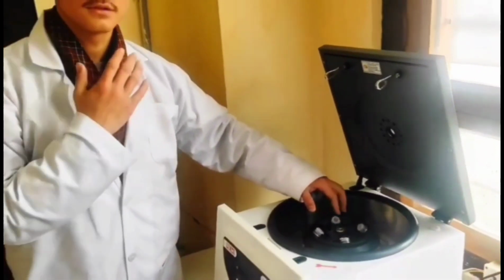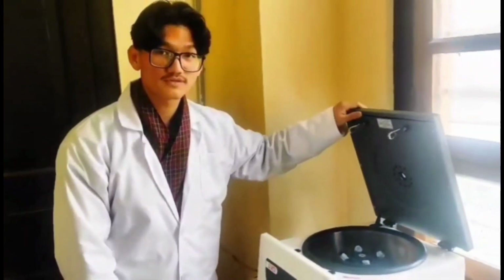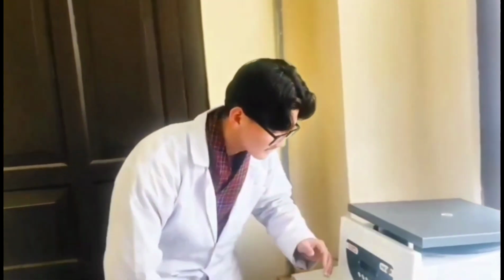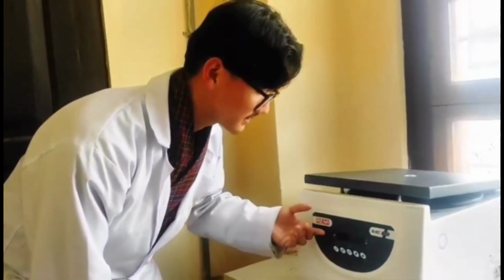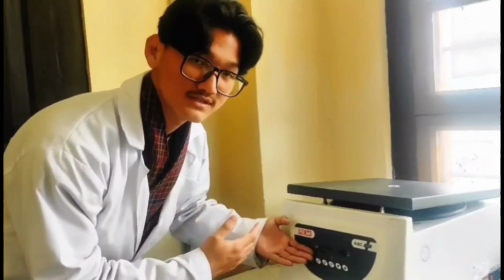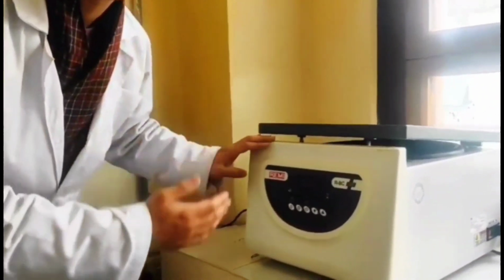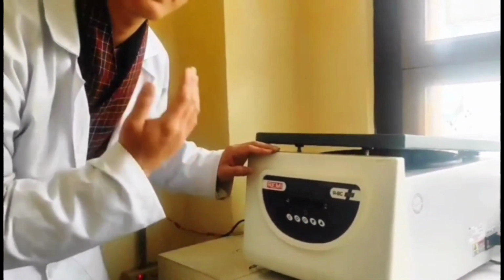So, we do not turn on the centrifuge machine when the lid is still open. Therefore, we have to close the lid. Remember that. As you close the lid, if you can come closer once again, we can see the control panel. It can be used to set the RPM, which is the number of rounds it makes per minute, and also the timer. For this specific centrifuge machine, the RPM and the timer are already set.